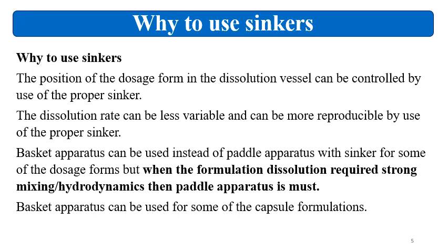Why does this happen? Because sinkers take the formulation to the bottom of the vessel, and that will be uniform compared to dissolution without sinkers. Now, basket apparatus can also be used instead of the paddle apparatus, because you may think that if the paddle apparatus requires the use of a sinker, then I can simply go and use basket apparatus.